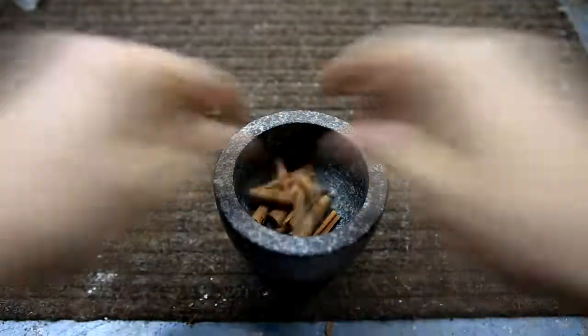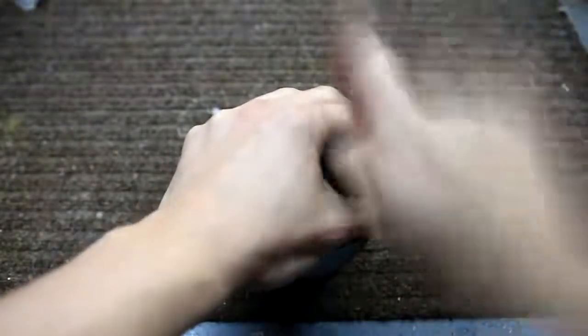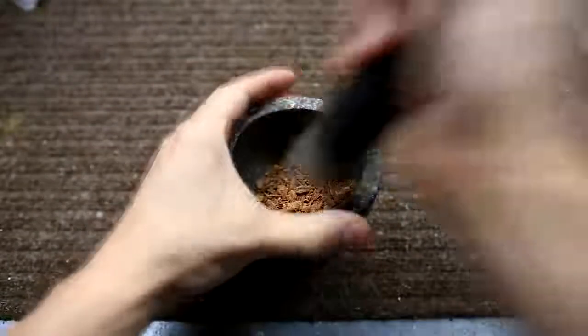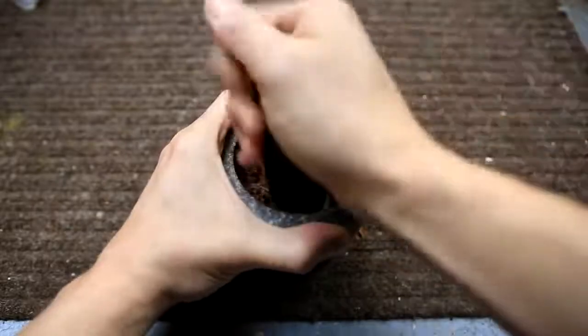Cinnamon sticks are broken into smaller pieces and placed into a mortar. Using the pestle the pieces are crushed into smaller bits. Keeping the bits moderately sized and not powderizing them keeps the foaming during the distillation to a minimum.